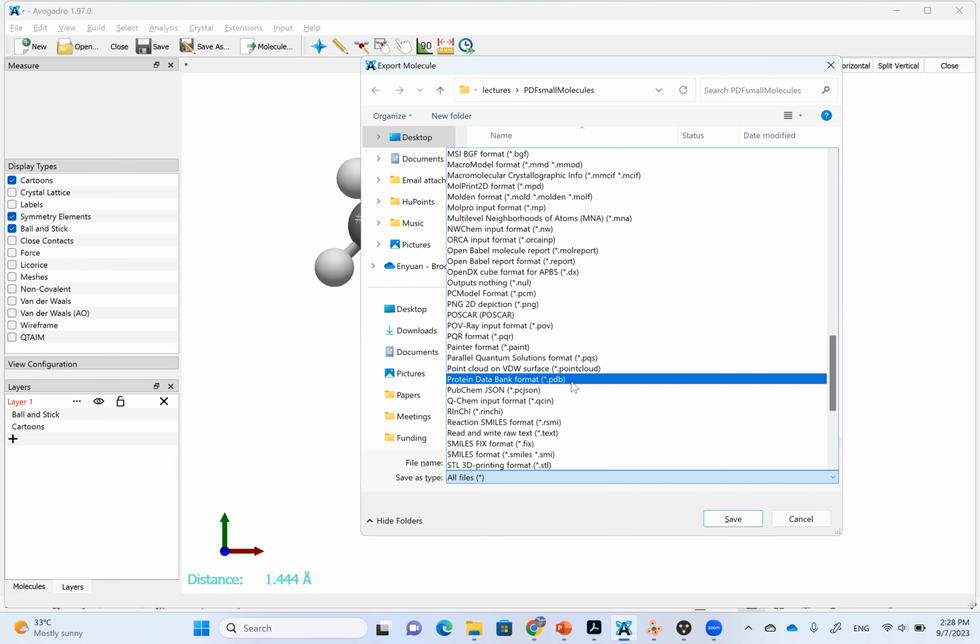And the challenge, or maybe the tricky part, is that we need to make sure the files communicate. I mean, the softwares communicate with each other, right? They should speak the same language. And the language is actually their file format. So we need to use a file format that can be transferable among different softwares.